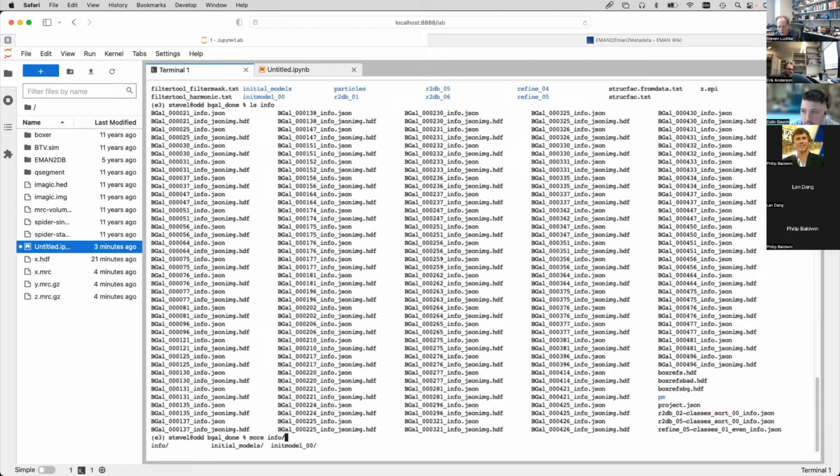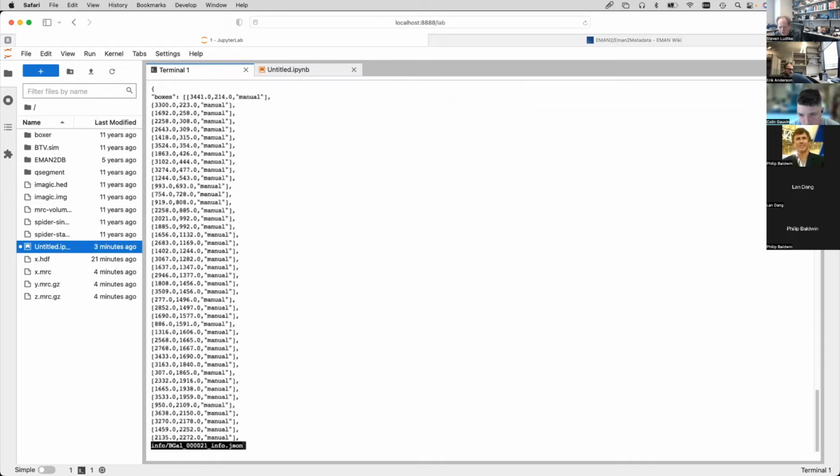It's a standard web format that's used in web programming a lot because it stands for JavaScript Object Notation. That's what JSON stands for. So it's easily readable inside JavaScript applications and web browsers and stuff like that. But if you look at it, it really looks pretty much like Python, because JavaScript defines dictionaries and lists using the same syntax that Python does.